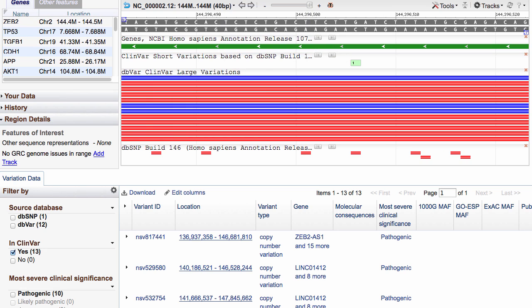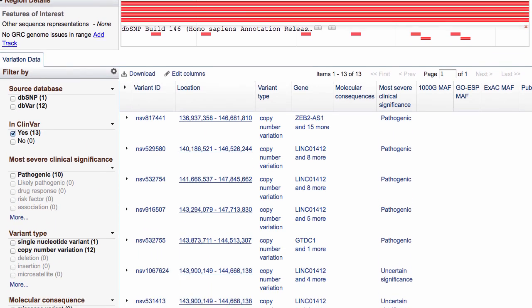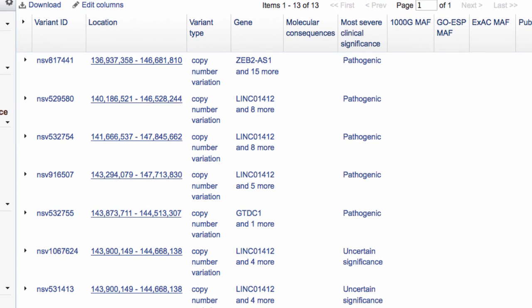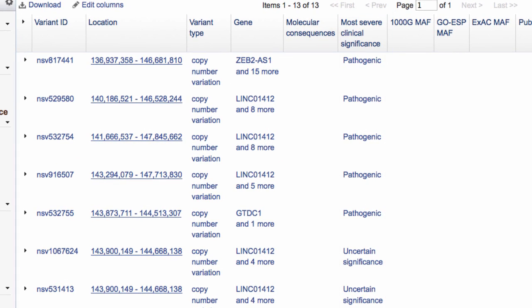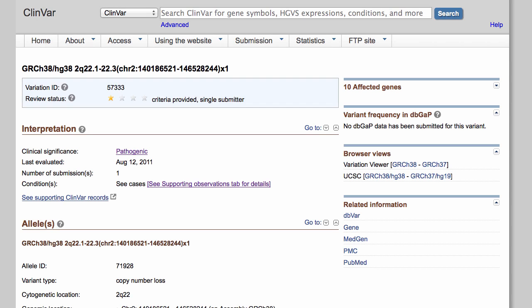In addition to the filters, the table gives you a summary for each variant, including the Most Severe Clinical Significance column, where the links go to the corresponding ClinVar record. So this approach can take you from a genome-based query to a specific ClinVar record.